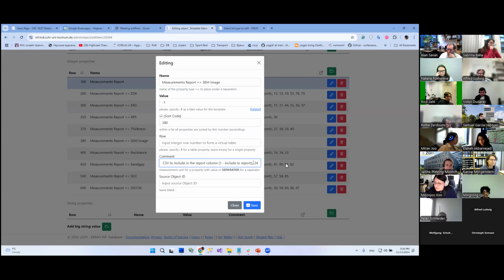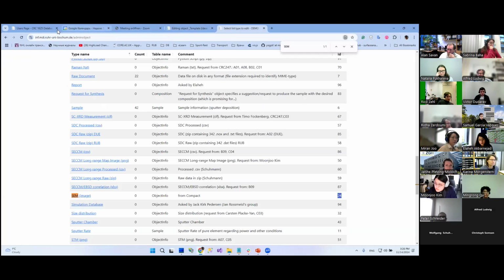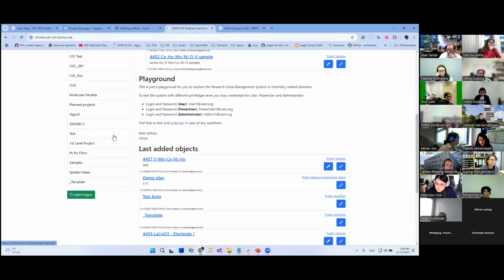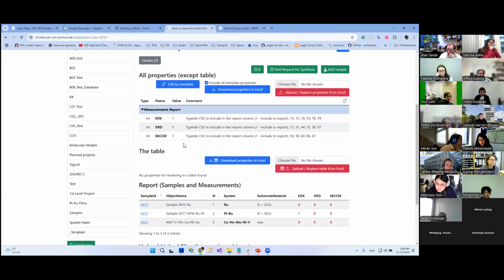Report, something like this. And then immediately this should be visible in our idea or experiment plan. So let's take a look.